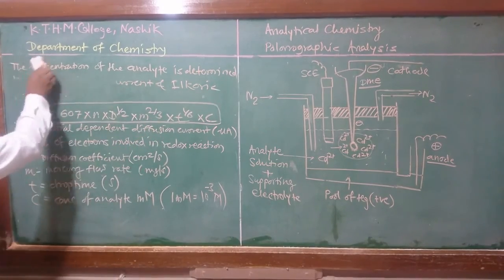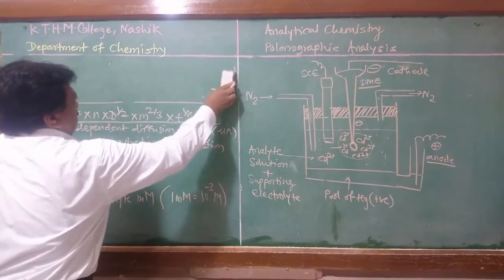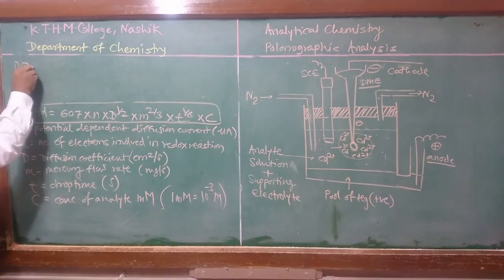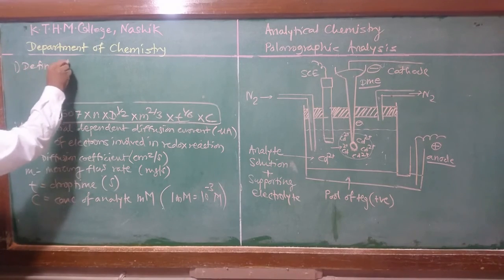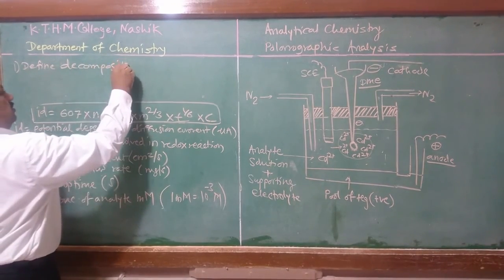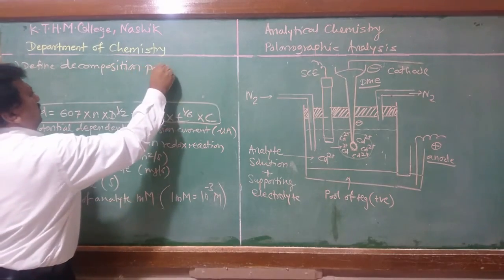Student, you can find out the answer of the following questions through this discussion. Number 1 is define decomposition potential.